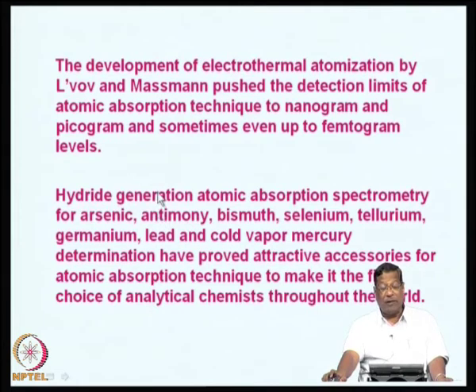And you will appreciate that all these elements are environmentally very important elements, and we have strict standards for their presence in the environment, and the standards refer to parts per billion level of existence in the air and water environment around us. So, atomic absorption spectrophotometry using hydride generation works for these elements.